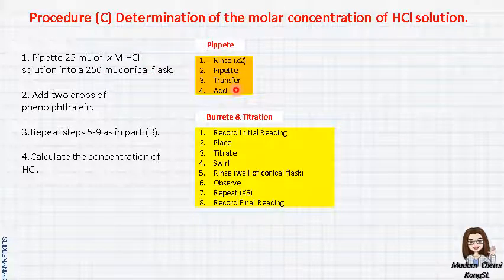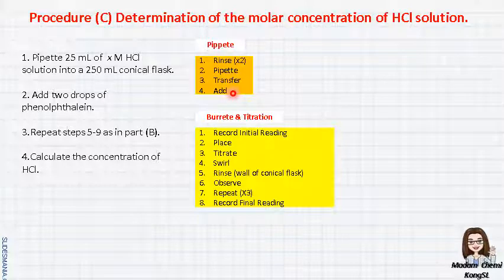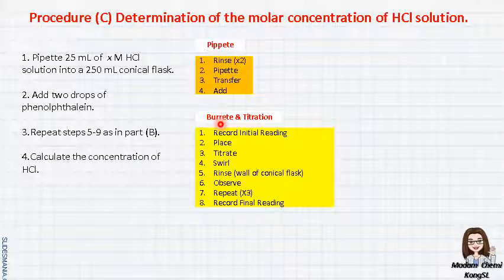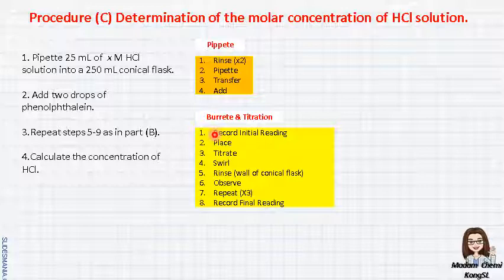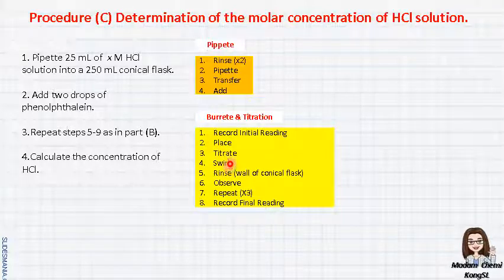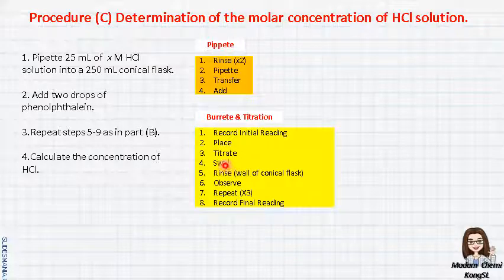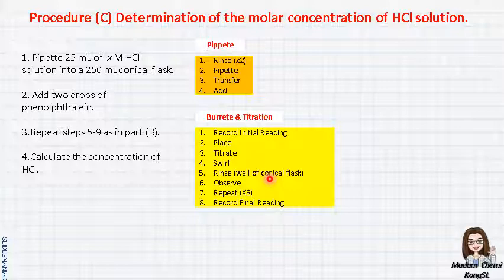The steps are exactly the same as Part B: rinse, pipette, transfer, and add the indicator phenolphthalein. Repeat steps 5 to 9 as in Part B. Record the initial reading for the burette, double-check for any air bubbles and discard them if present. Place a white tile on the retort stand, then start the titration. The sodium hydroxide drops into the conical flask containing HCl. Halfway through, stop and rinse the conical flask with distilled water to ensure acid and base properly react. Observe the changes in colour and repeat 3 times.